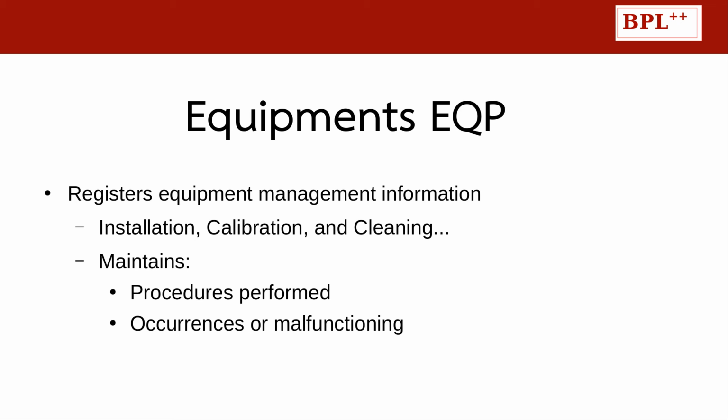The equipment workflow registers equipment management information used in the lab, such as installation, calibration, and cleaning. Using this workflow, it is possible to trace procedures performed on a particular equipment and occurrences or malfunctions in such equipment. It is straightforward, for example, to determine which problems have not yet been corrected or when equipment operations such as cleaning or calibration are due.